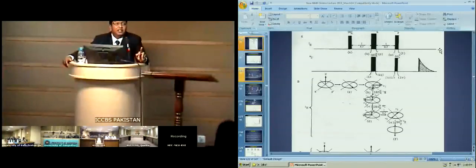So there is a gross reduction in proton signal, but still visible. And you don't want to see proton. Please kindly understand that you are not really worried about the proton. It is reduced subtly. It reduced to nil.